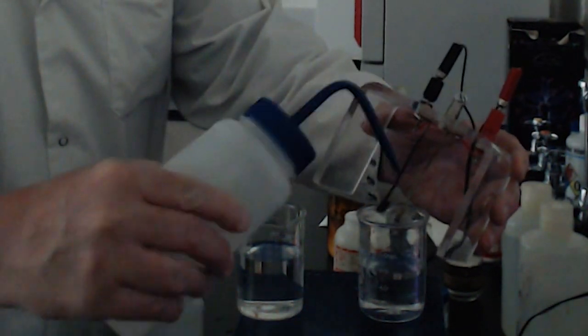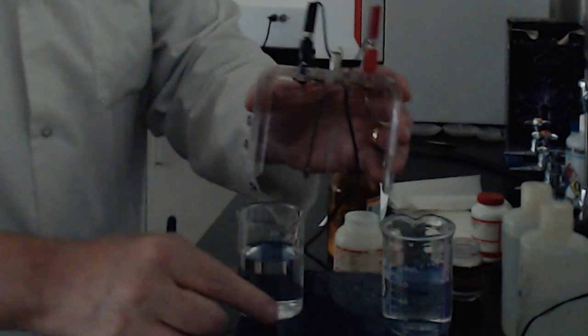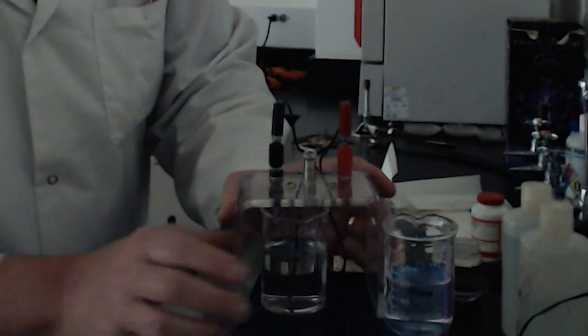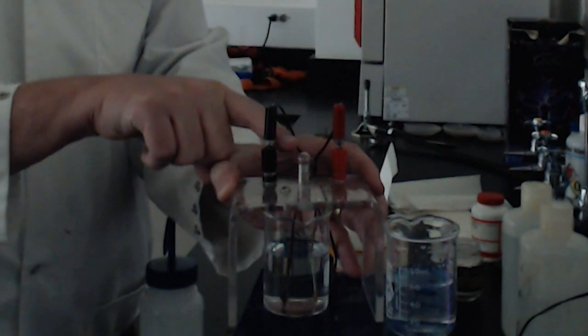Let's see what happens. So, first the stomach acid, also known as hydrochloric acid. Wow, as soon as I touch it, you see how intensely bright that light is? So hydrochloric acid, we're going to use in today's lab as an example of a strong electrolyte. And here is vinegar. Come on, vinegar. It'll glow eventually. Oh, if you get up close, let me turn off the light. There's a tiny glow of the filament.